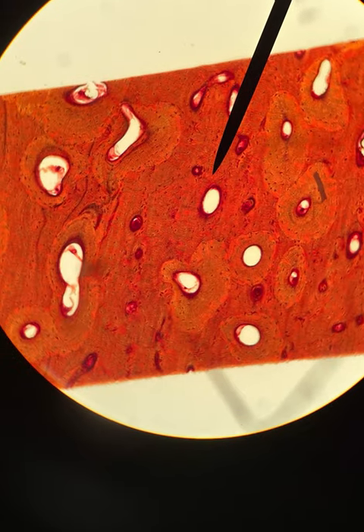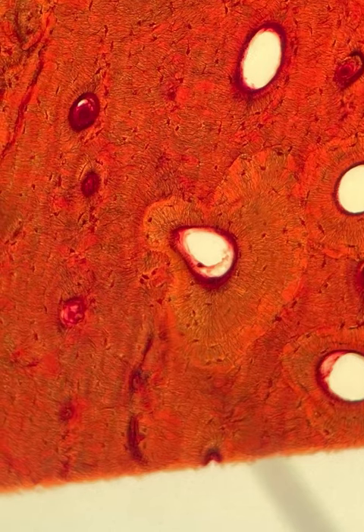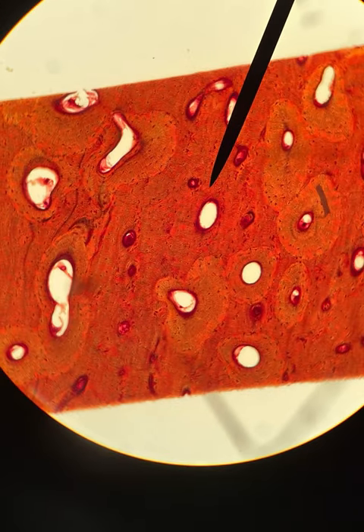This is a compact bone specimen, and you can tell right away, it looks like if you were to cut a tree in half or a section of a tree. It's very beautiful. So this is bone, and of course it's found in the skeleton, and it enables us to store calcium and phosphorus, among other things.